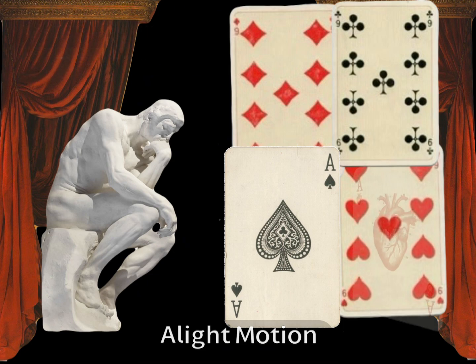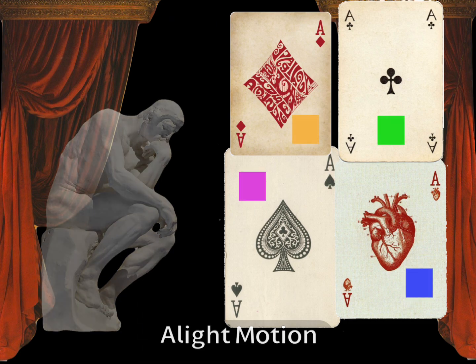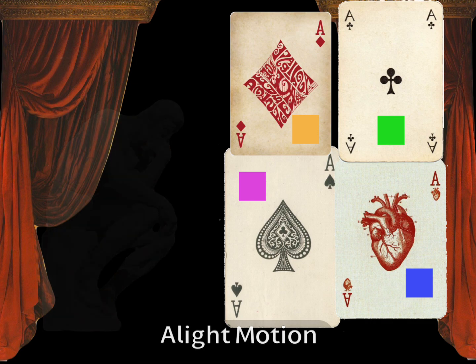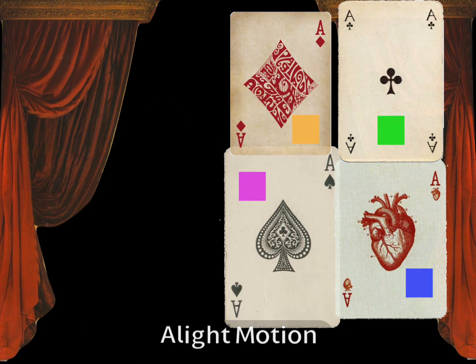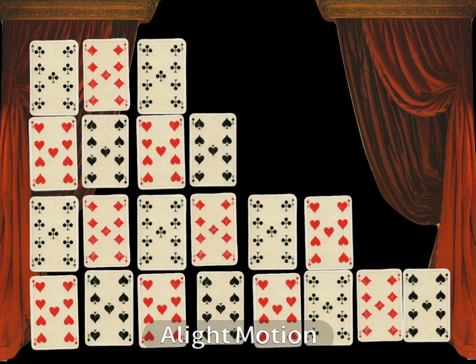Our radioactive tag sits on each ddNTP. In our metaphor, let's say that each ace has a mark in the white space that's written in invisible ink and can only be seen with UV. Now that that's sorted out, we can simply sort our card chains by length, emulating what would usually be done by electrophoresis. Then take out a little UV light to see each quote-unquote radioactive marker, aka our invisible ink.